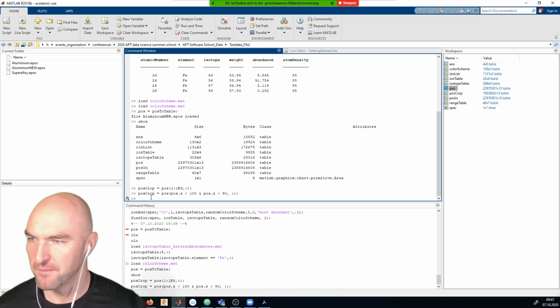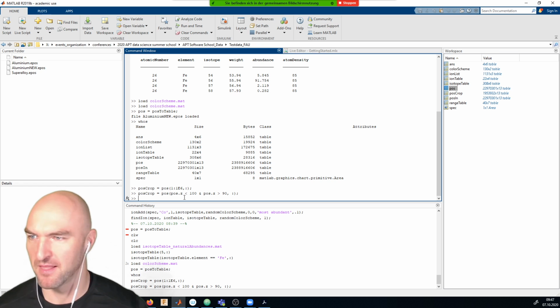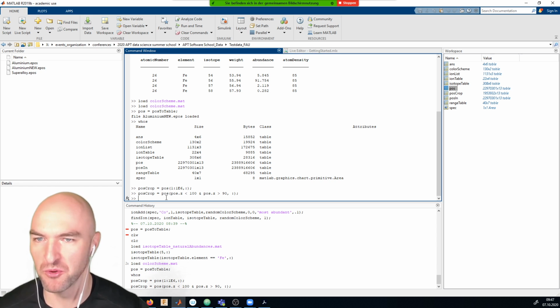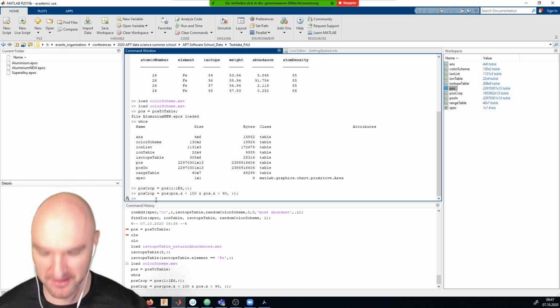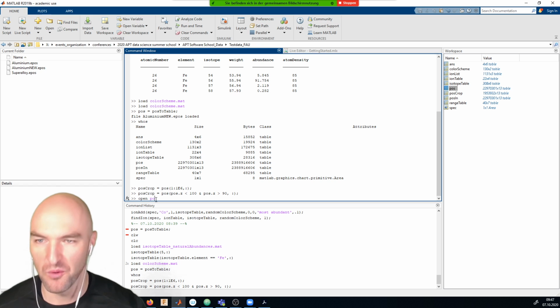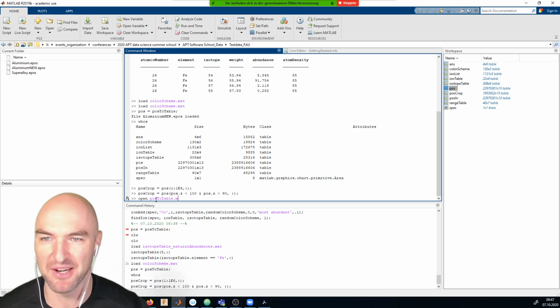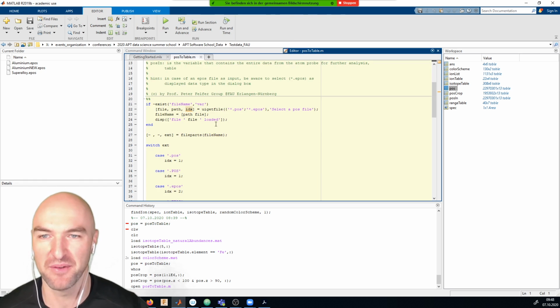So, okay, how do I open the script from the toolbox? Because usually I have not worked off of the toolbox yet. Open pos to table. Thank you. So we obviously give you a troubleshooting guide already. This was totally planned because we wanted to show you how to fix something.